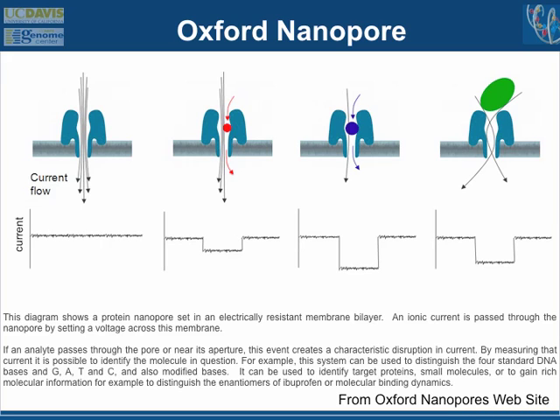So this Oxford Nanopore company has been around for a long time, and there are many companies that have been around for a long time talking about this thing called nanopore sequencing. And basically, there are a lot of different derivatives of it, but you have some pore. What Oxford Nanopore actually does is they use a real protein that has like a hole in the middle of the protein, one of these membrane transporters. And they measure sort of the electrochemical gradient and current generated through a membrane by stuff, in essence, any type of thing. People have been using nanopores for all sorts of different purposes.